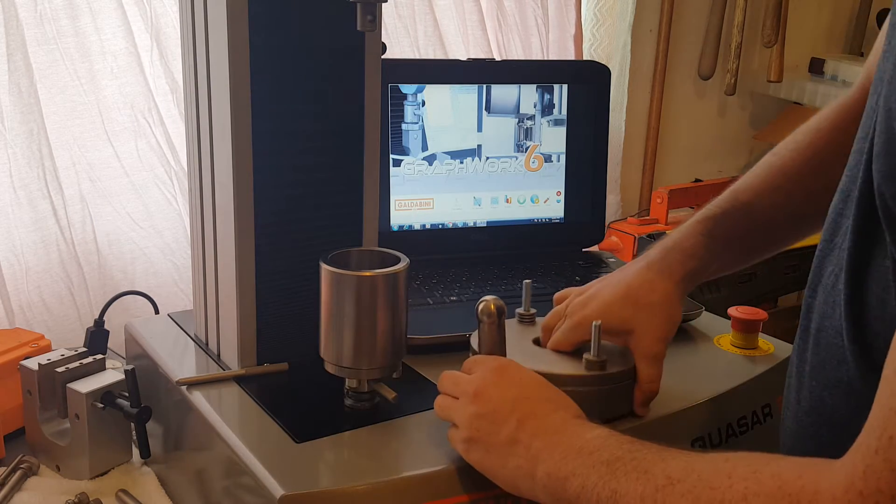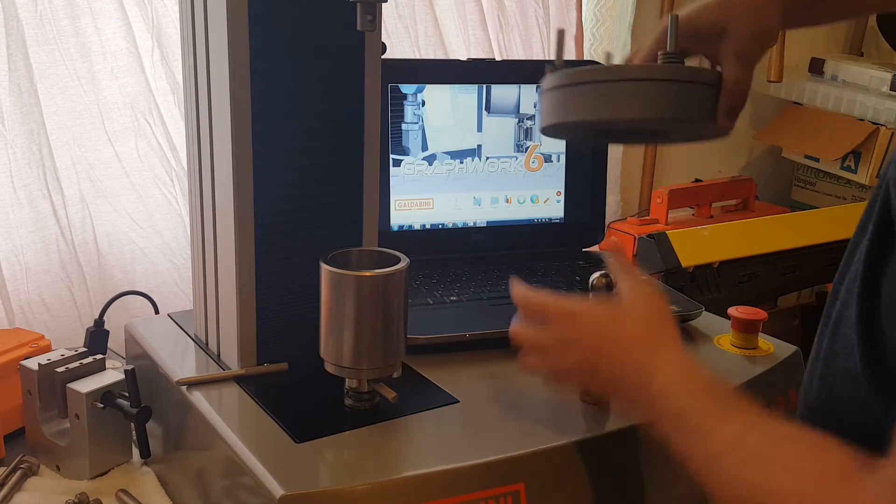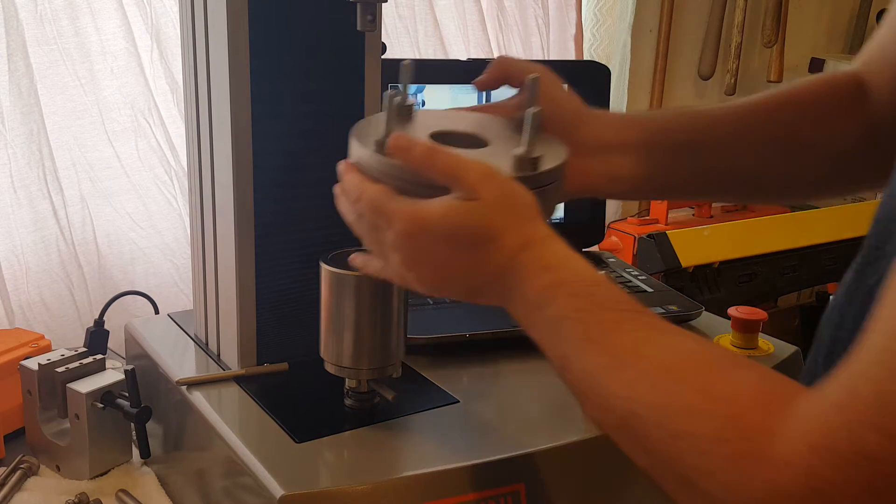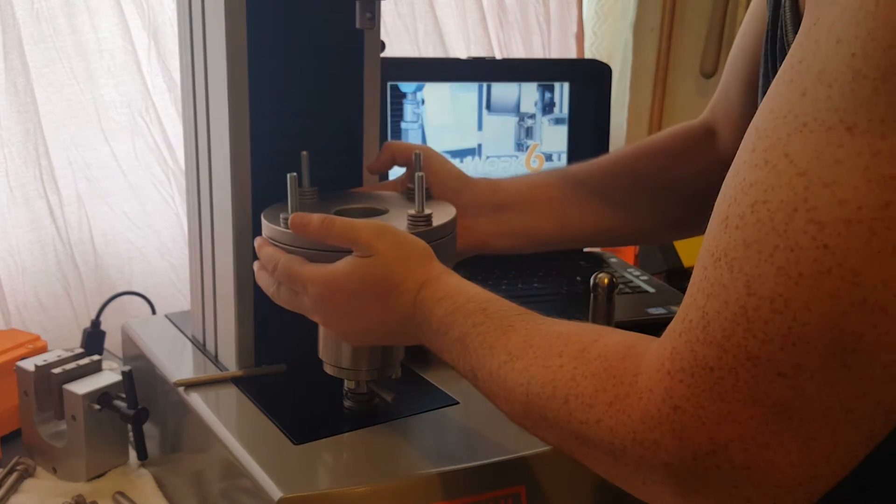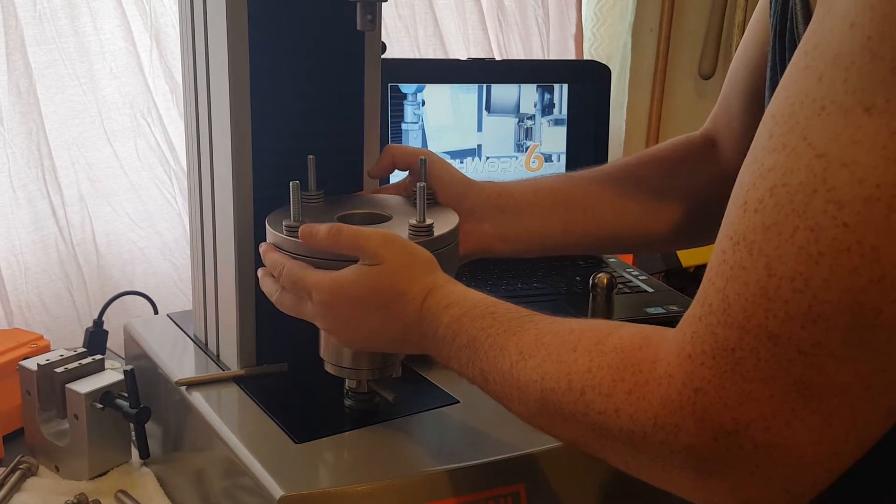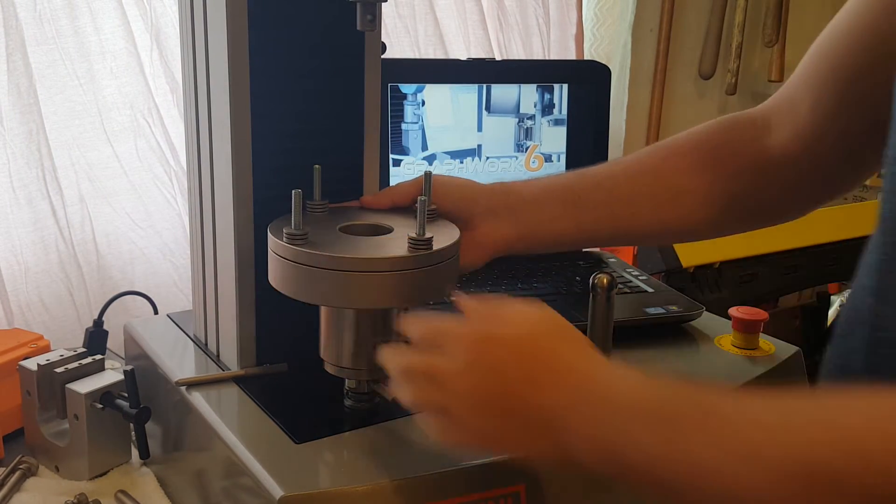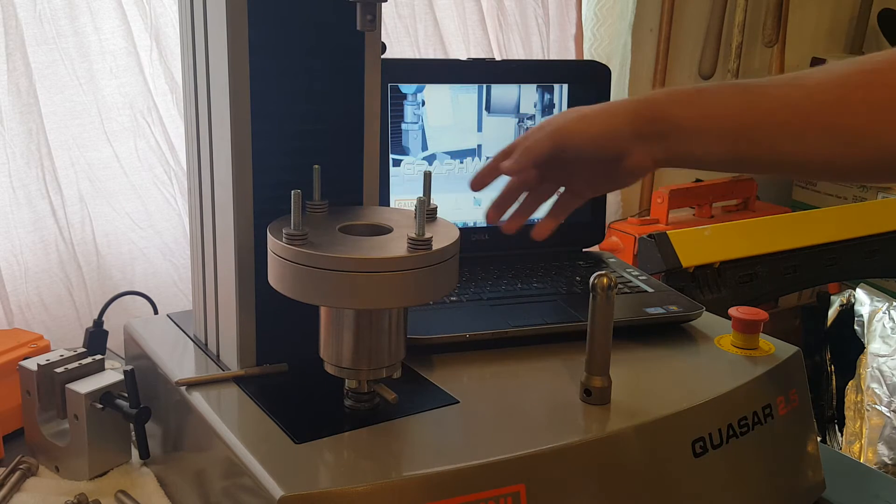Now we're going to mount the next part of the base of the fixture right on top here. That slides right on.